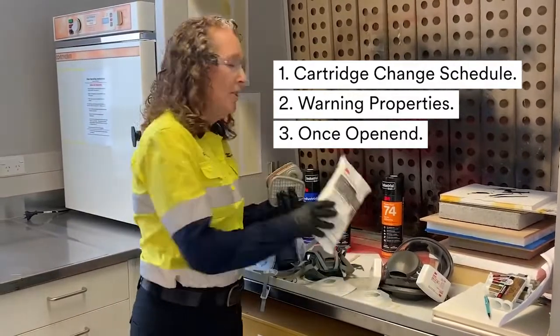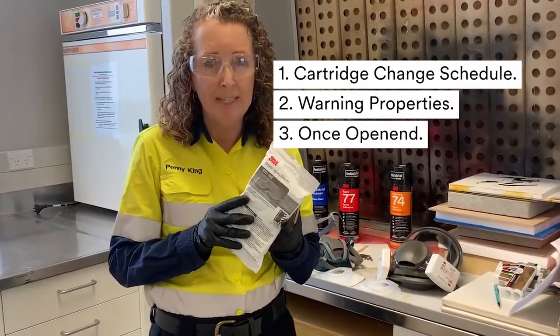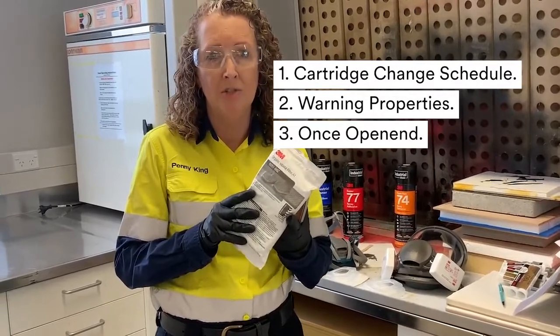Step 3: Once you do open your carbon cartridge, use it for no longer than 6 months — but please remember to always go back to your cartridge change schedule.